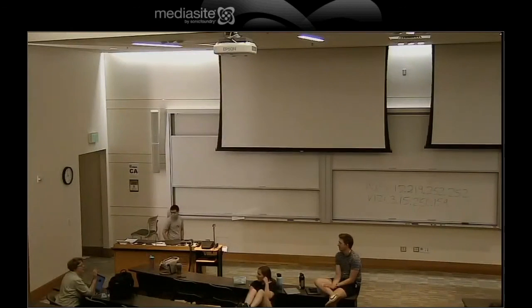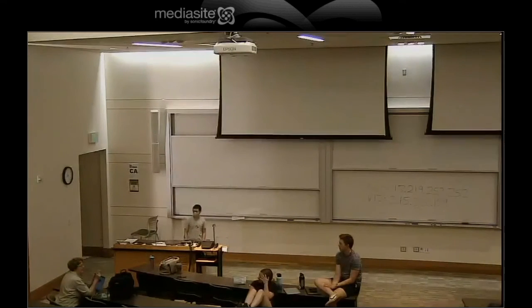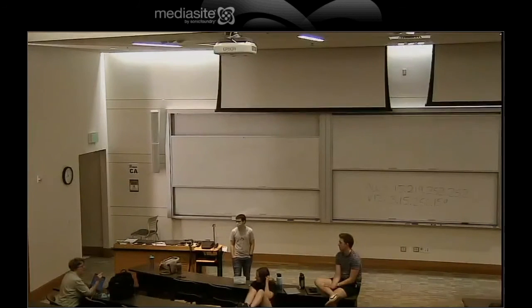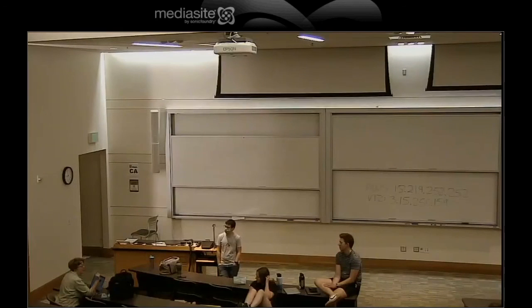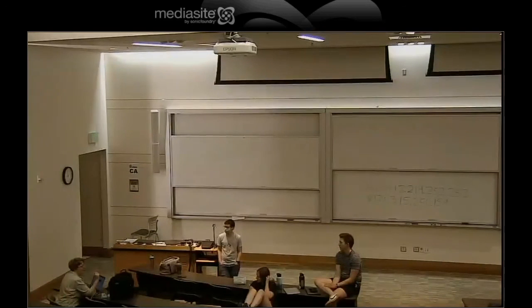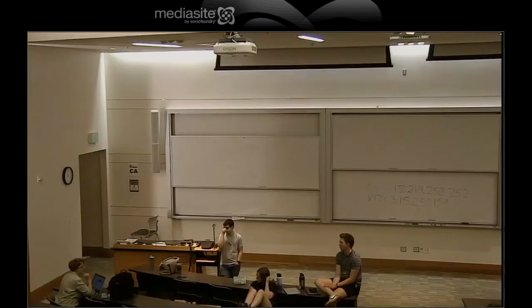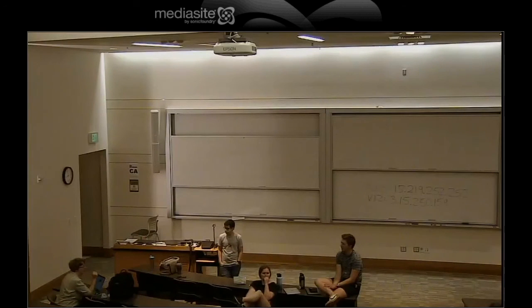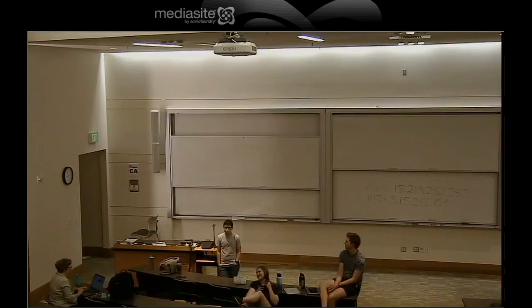What? It's really cool. I know it's silly, but DESeq results can have NAs in the P value adjusted. Yeah. Because you're sorting by the P value, not the P value adjusted, they show up as being high, even though they don't show up as differentially expressed. I ran into this the other day, and I'm like, why is this gene not showing as differentially expressed? That's tricky.